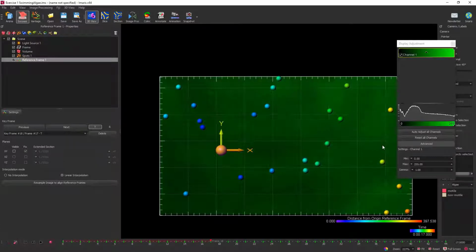Okay, thanks, Daniel, for going through that. And then you can just give the answer in words, but Orly was asking, if we do use a reference frame, is that reference frame able to help us with intravital imaging where you have a heart beating or breathing? And what are some things to think about with that?